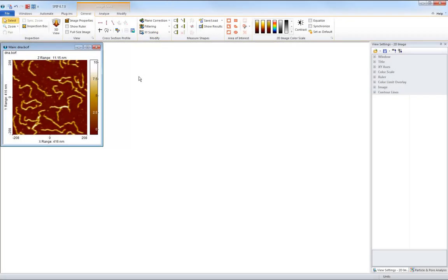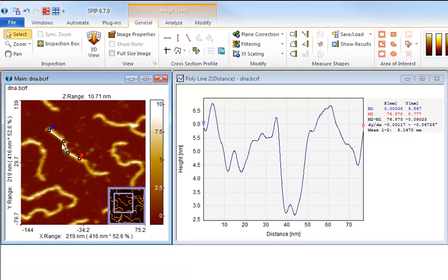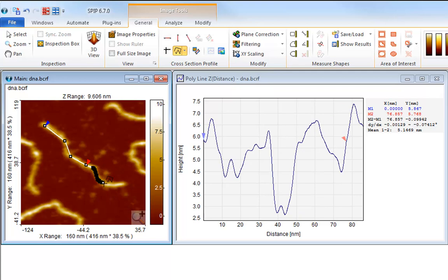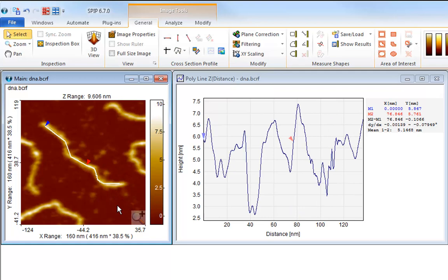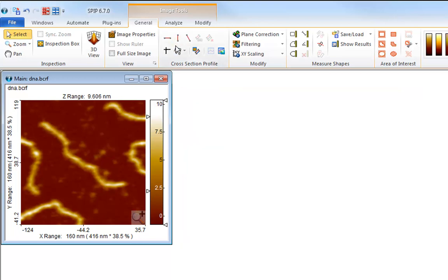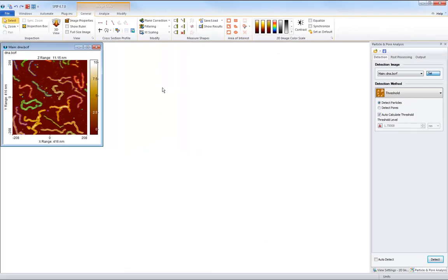For drawing freeform cross-section profiles, SPIP has the polyline profiling tool. Click the tool button and add nodes by clicking the left mouse button. End by clicking the right mouse button. You may also draw freely by holding down the left mouse button while drawing, still ending by a right click. There can only be one polyline profile at a time, so delete the old one before drawing anew. One of the most common uses of the polyline profiling tool is to measure distances along worm-like structures, such as DNA strings.